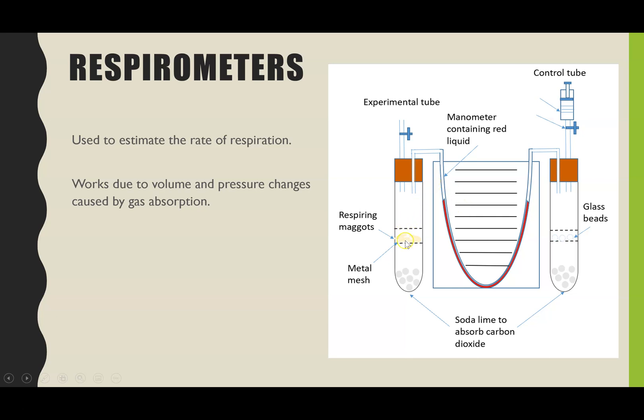Our experimental tube will have a living organism within it that will respire. Now I'm using maggots as the example today but you could do this experiment with wood lice or sometimes with plants in particular peas is a common example, fresh peas which should still be respiring. In both test tubes we have sodalime. The purpose of this powder or the granules of sodalime is to absorb any carbon dioxide so then we'll know any changes in volume are just to do with oxygen being absorbed. You'll have a piece of gauze or a metal mesh just to make sure those maggots can't touch the sodalime because it would be harmful to their skin, it could be an irritant.